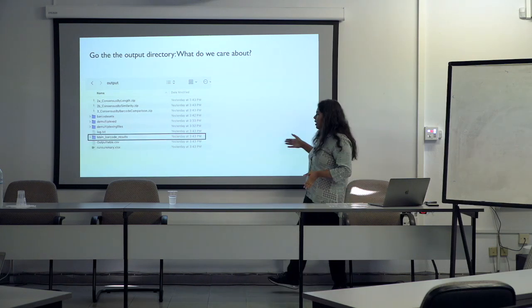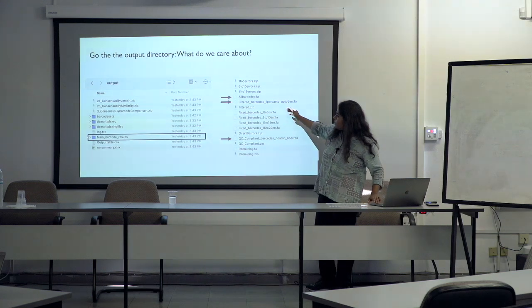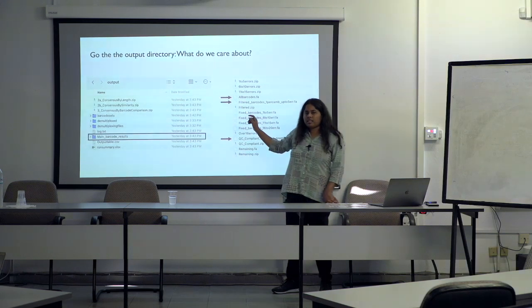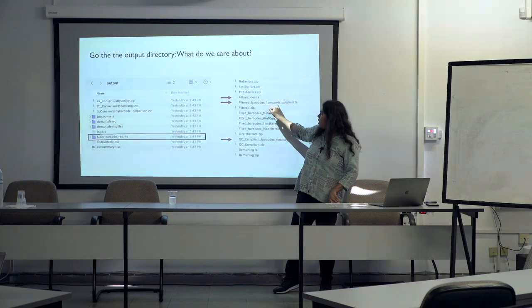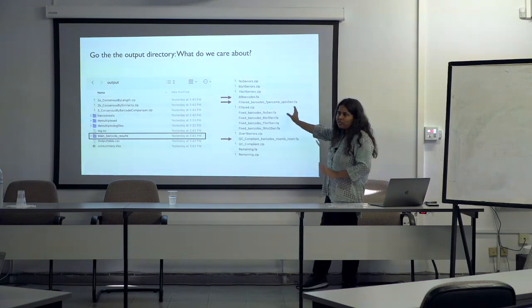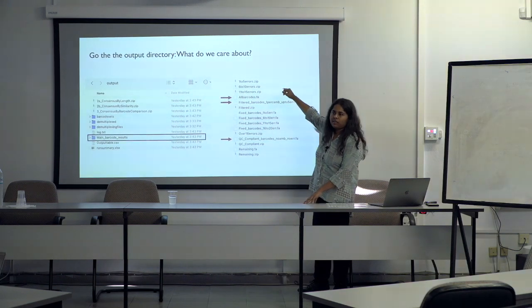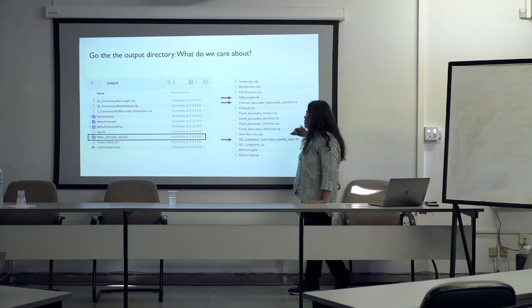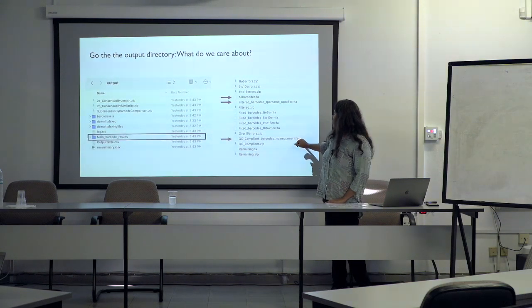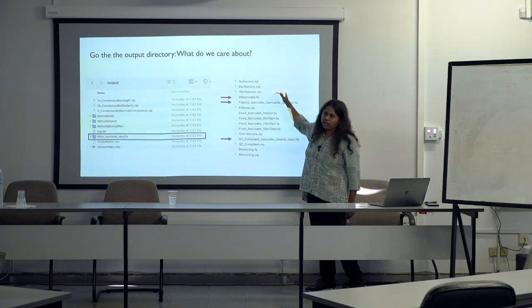The key things that you want to care about are the main barcode results folder, which has your barcodes, and the file that we recommend, which is the filtered barcodes file. This allows a bit of leeway, basically 1% ambiguities. A little bit of Ns is allowed in your barcodes, not too much. All barcodes has everything, including lots of Ns and lots of incorrect barcodes. QC compliant is completely strict: no Ns, perfectly translatable, and nothing fixed. So if you are really, really strict, there are 3 levels to this.